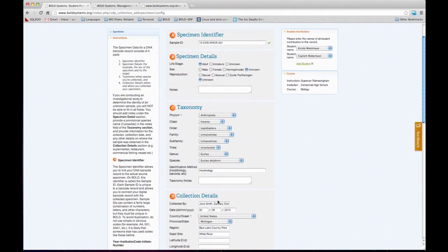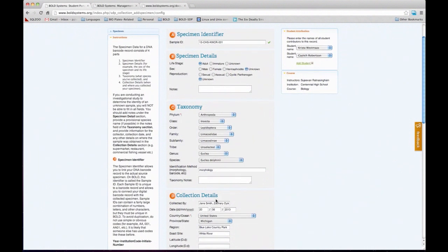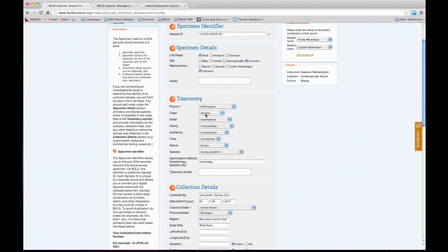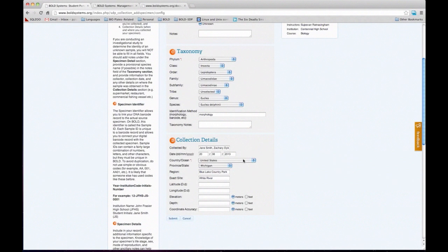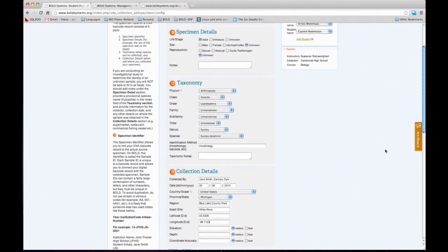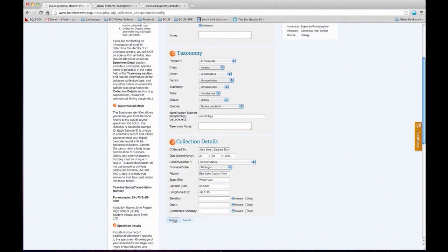In this case, my latitude is 43.53.28 and longitude is minus 86.23.23. Once all the form is filled out and you have the student attributions, you can click Submit. I put the date incorrectly — error messages will be thrown if there is anything wrong. It's usually very helpful because you can figure out what went wrong. The system is pretty self-sufficient, so if there's anything obviously incorrect, it will let you know. Let's try that again.